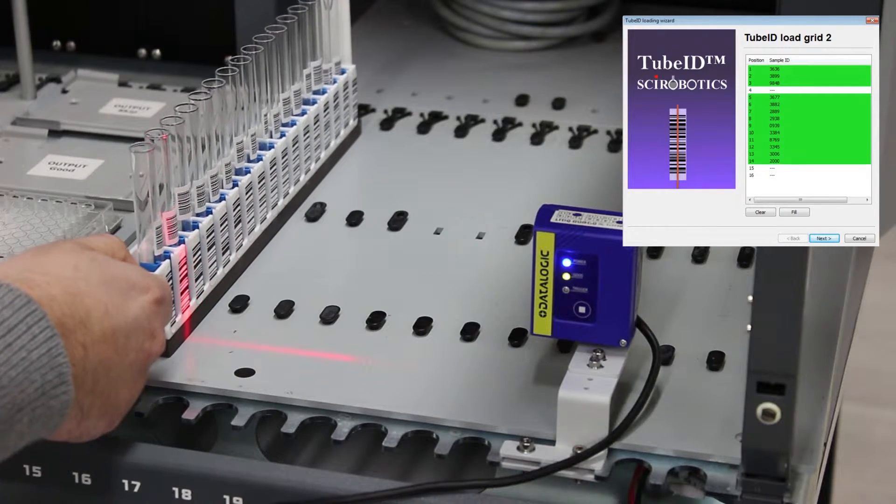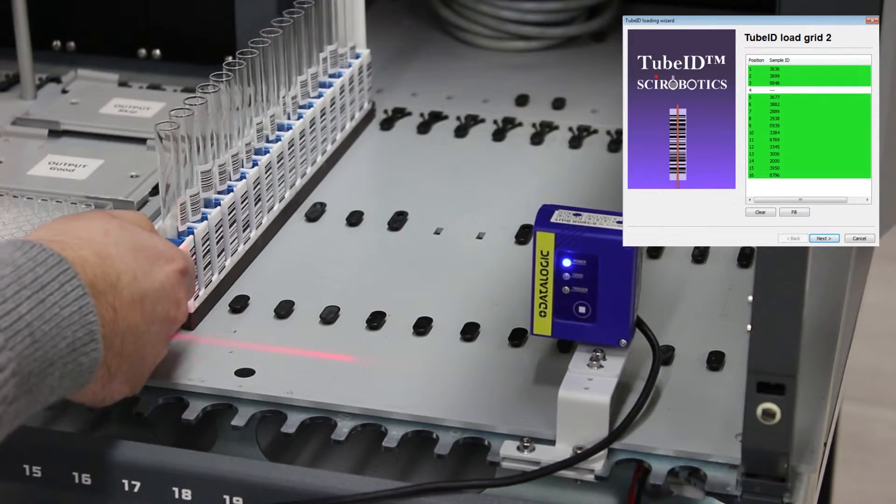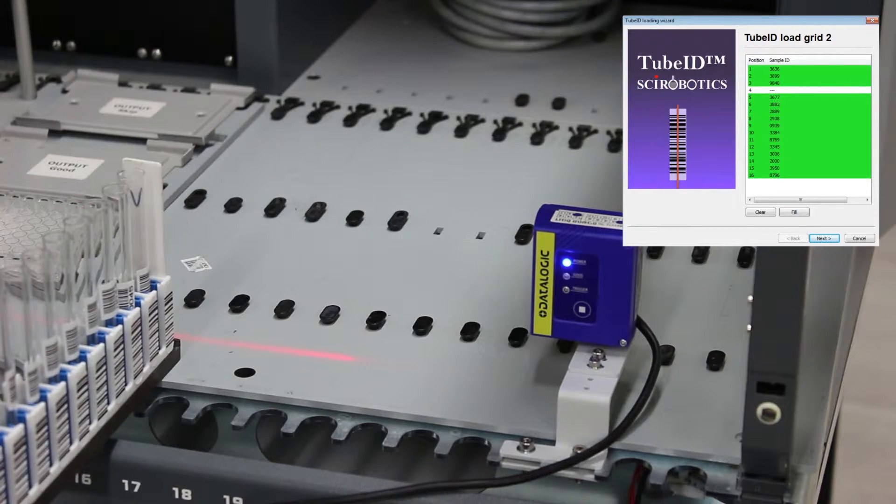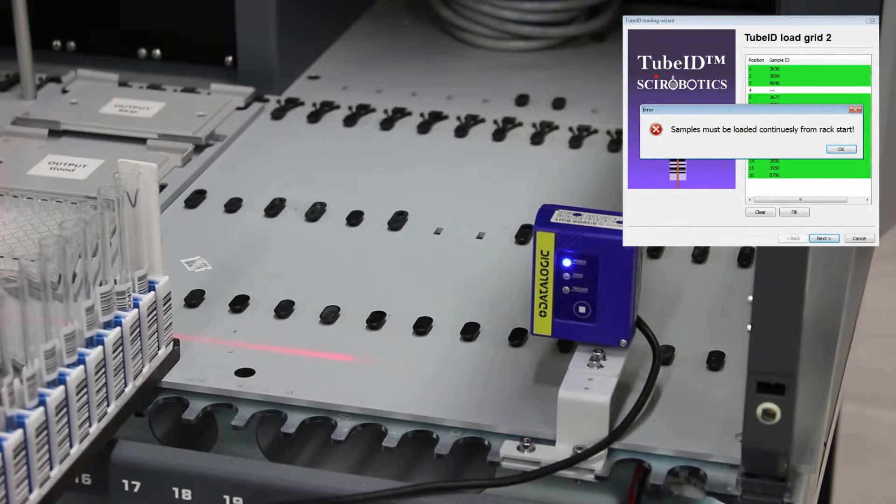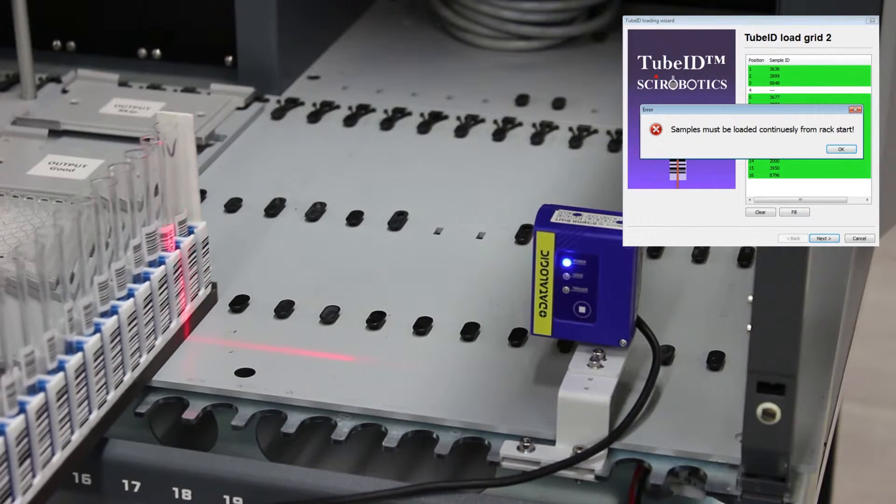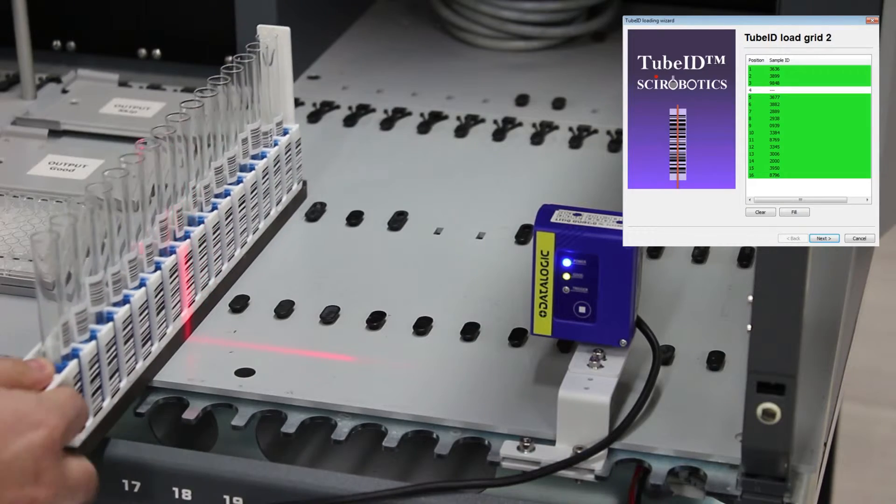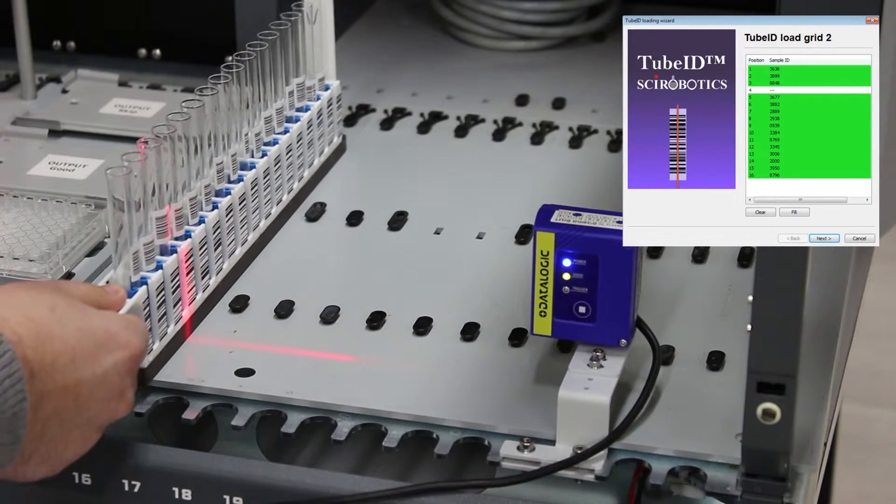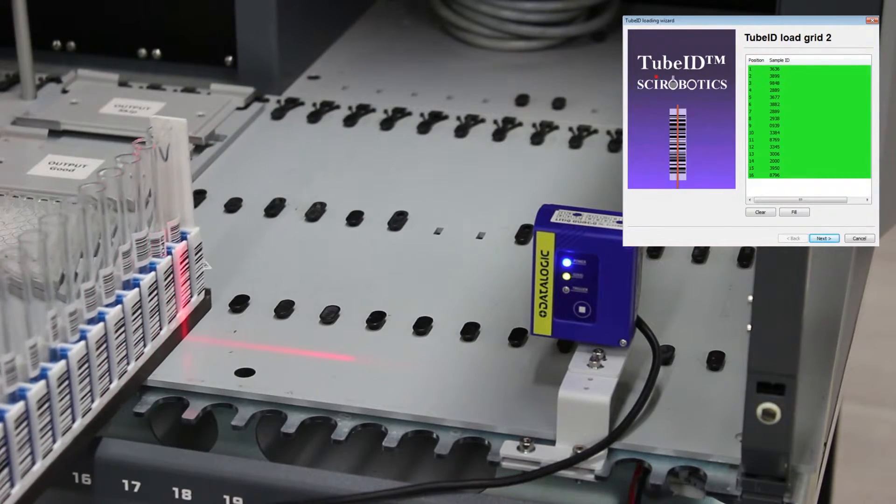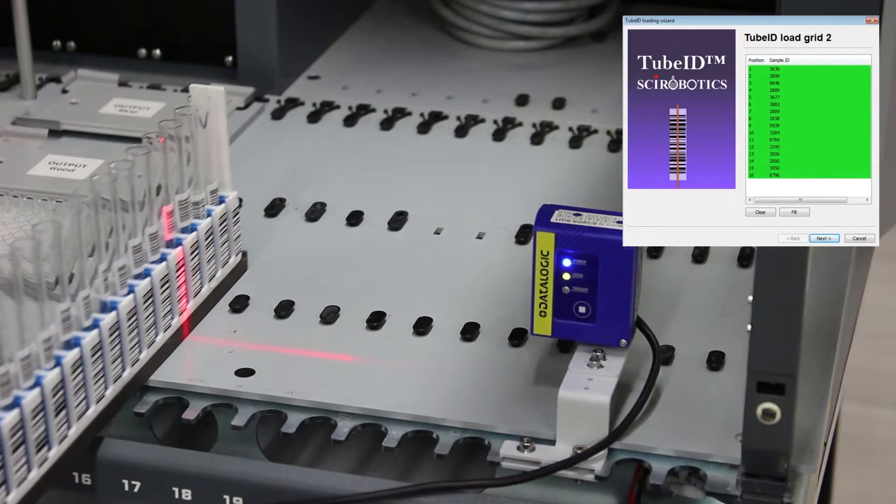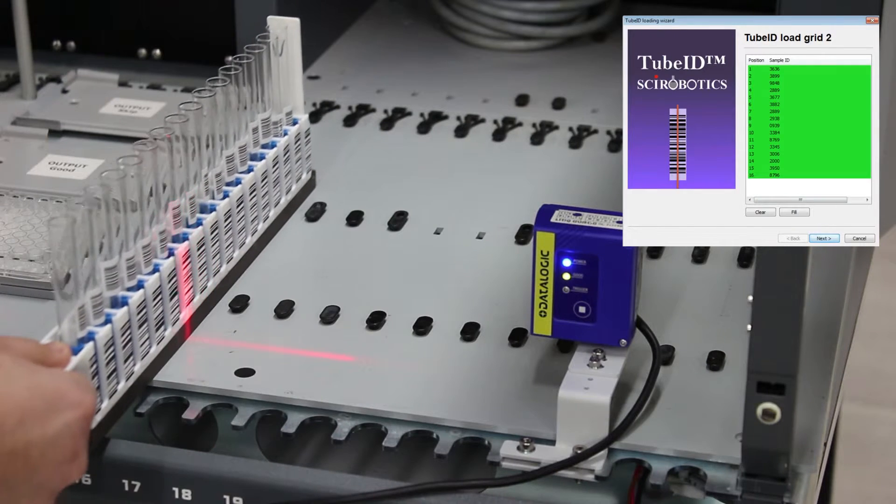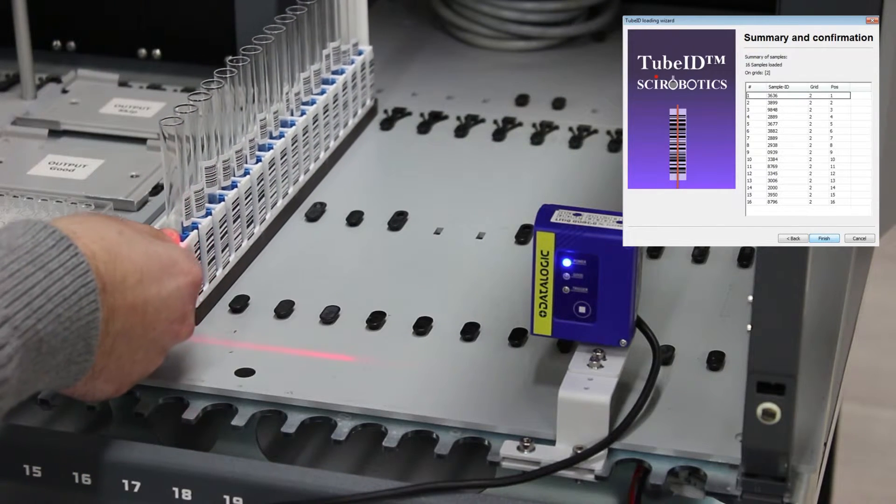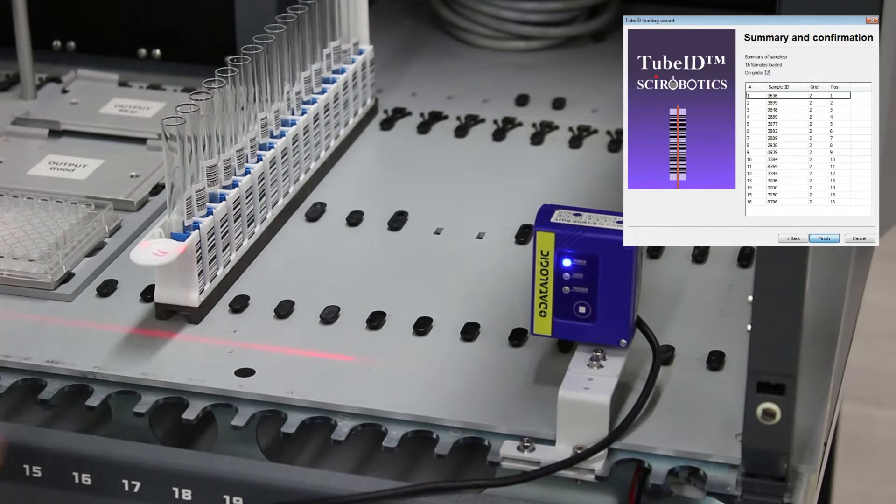In some cases, if the tube rack is moved too quickly, some of the tubes will not be read. In this case, we cannot proceed with the TubeID wizard. We can then move the tube rack back and forth until all tubes have been read, and only then continue to the next tube rack.